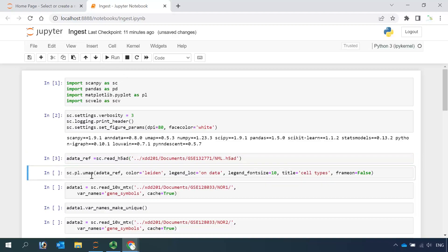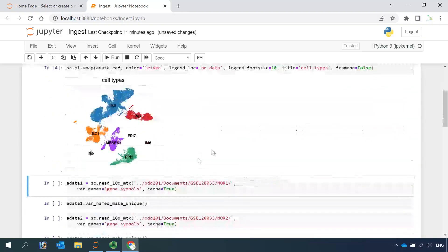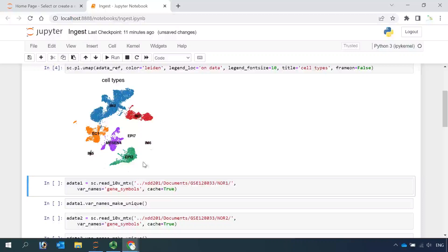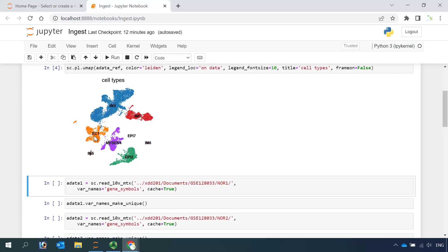We can use the plot function to have a look at the cell clusters. You can see we have eight cell clusters in the dataset. We annotated four immune cell clusters: immune 0, immune 3, immune 5, and 6. We have one cell cluster as endothelial cells, one cell cluster as mesenchymal cells, and two cell clusters — cluster 2 and cluster 7 — as epithelial cells.